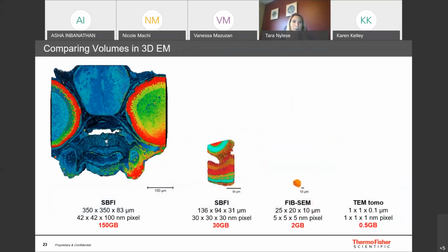And in the world of VolumeScope, we're actually looking at much larger volume. And this builds off of classical microtomy, where we use physical sectioning to section off materials, thin layers in a block. And so if any of you are familiar with sectioning or SEM or TEM sections, even obviously light microscopy, you know that there are some challenges associated with that.